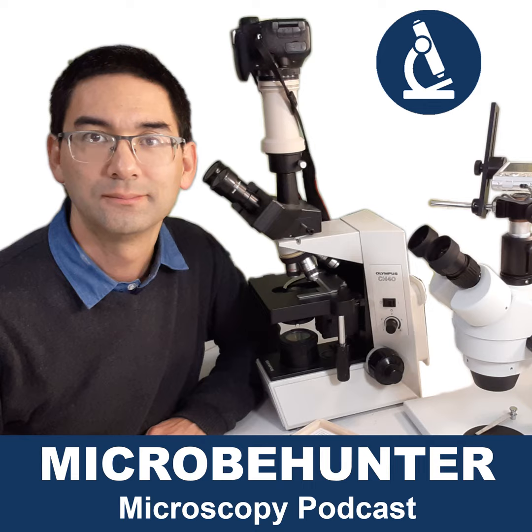They independently of each other gave very similar opinions. I asked them, what do you think about the infinity objective systems? And they both essentially said, well, it's almost a question of taste. It's nice to have, but it's not really necessary, and we'll see whether this system is going to be successful in the future. This was what they communicated to me as a consumer. One of them actually said it's kind of a question of taste.